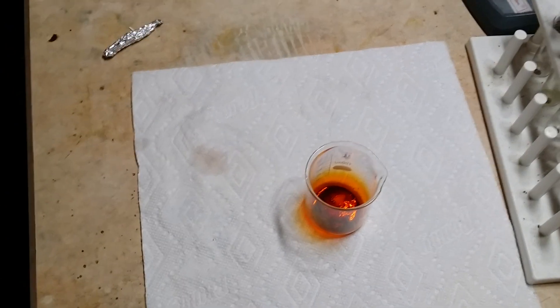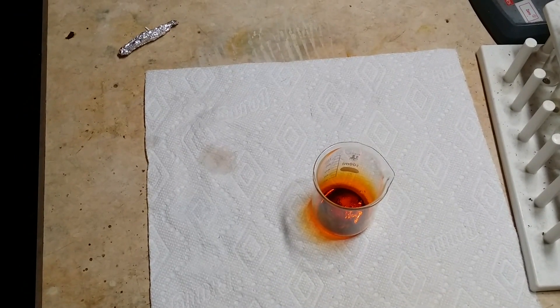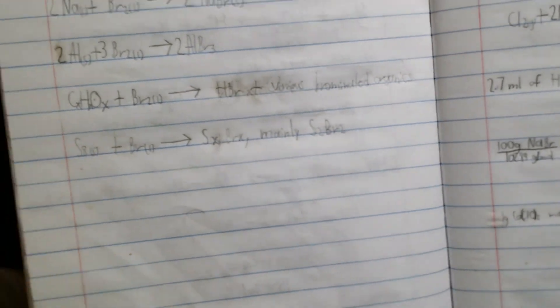Let's try some reactions with the bromine. I expect all these reactions to be very violent, so you're going to have to prepare accordingly. With metals, it will make their corresponding bromide salts. With organics, it will make hydrobromic acid plus various brominated organics depending on what organic you're dealing with. With sulfur, it will make sulfur bromides — mainly disulfur dibromide.